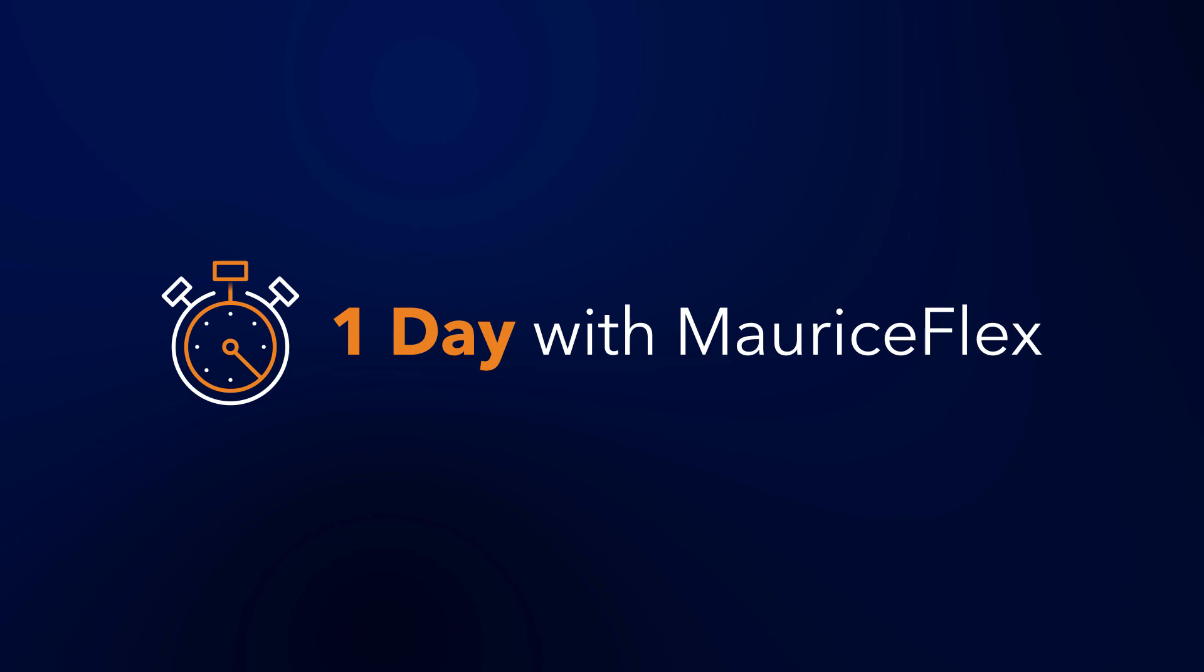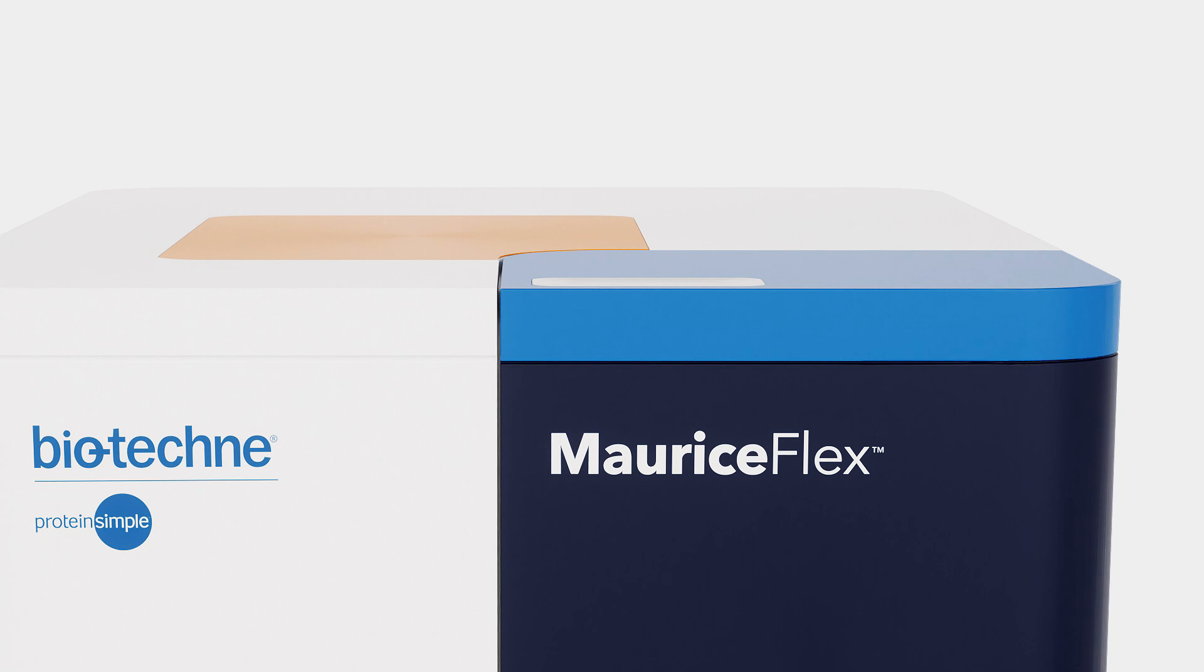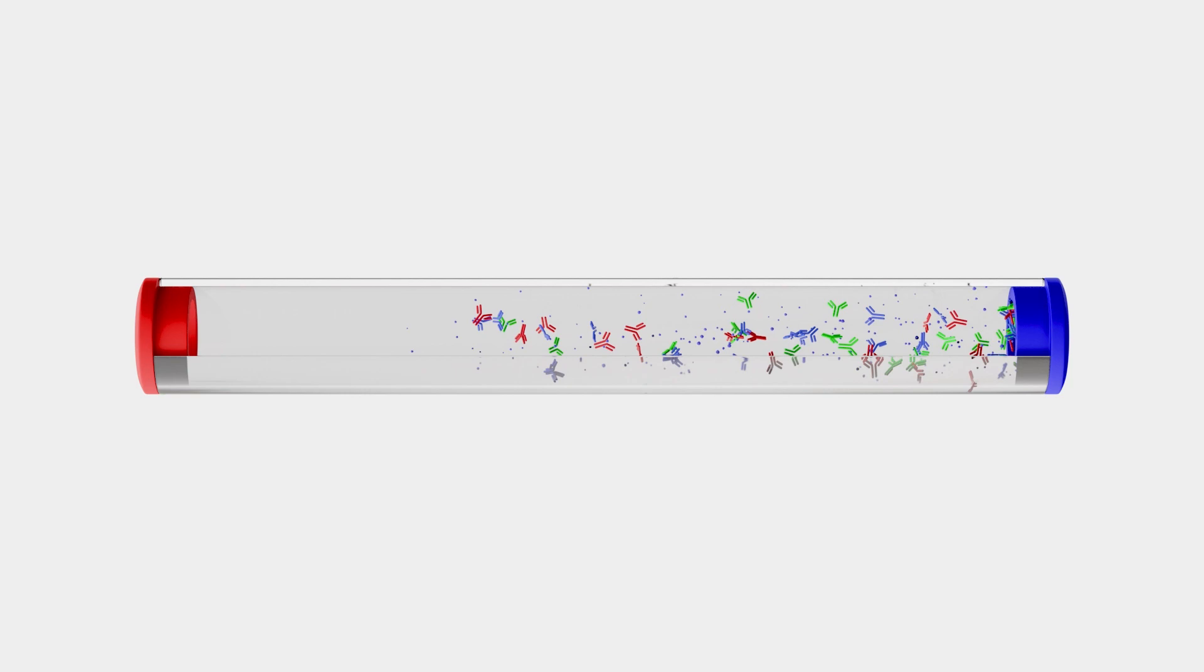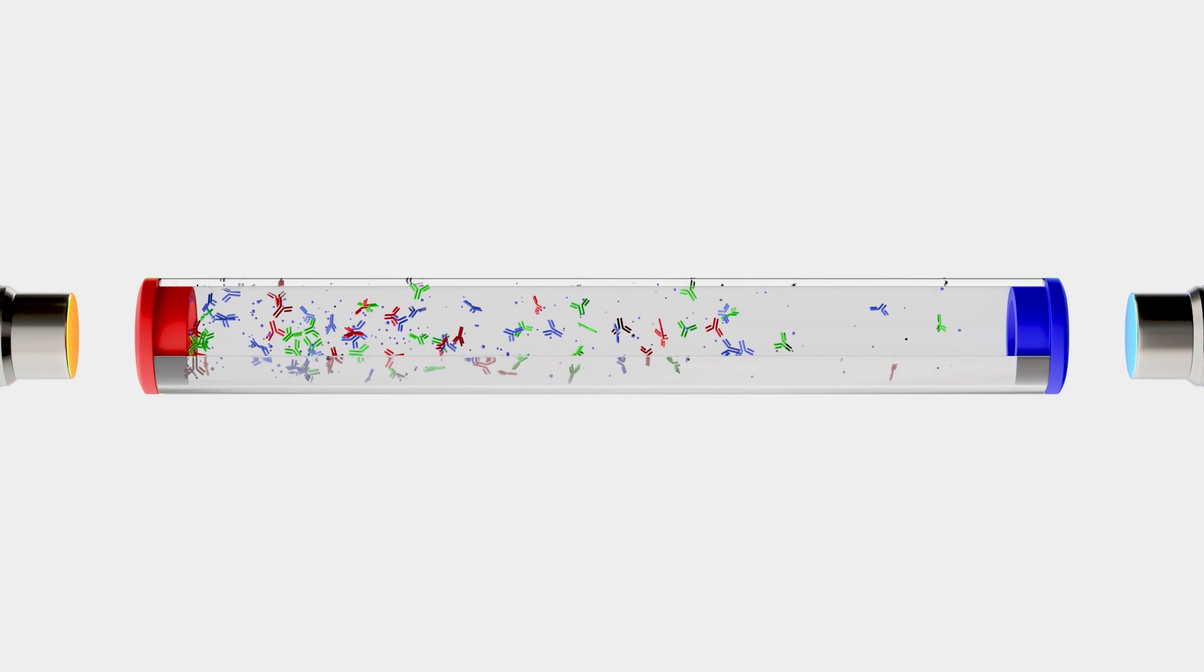MauriceFlex's unique isoelectric focusing-based fractionation is simple. First, MauriceFlex loads the protein sample into the capillary, into the flex fractionation cartridge. An electric field is then applied to create a pH gradient within the capillary.